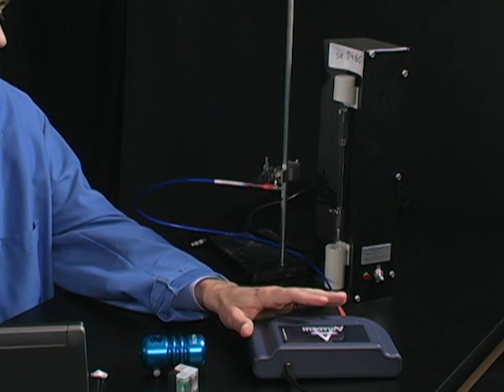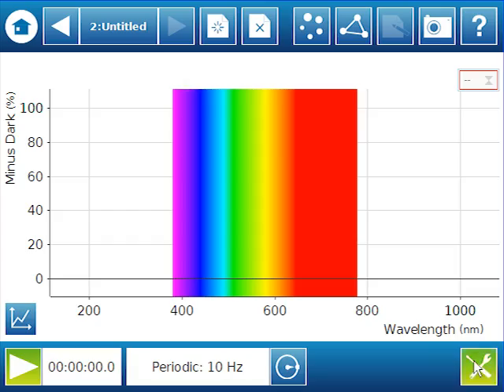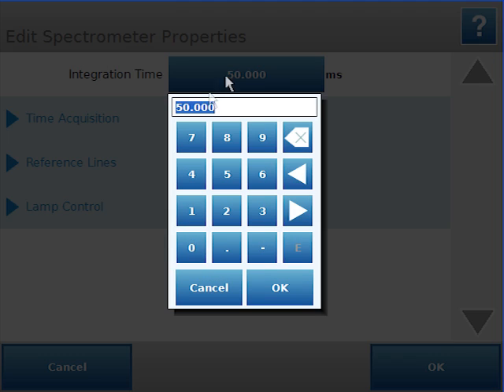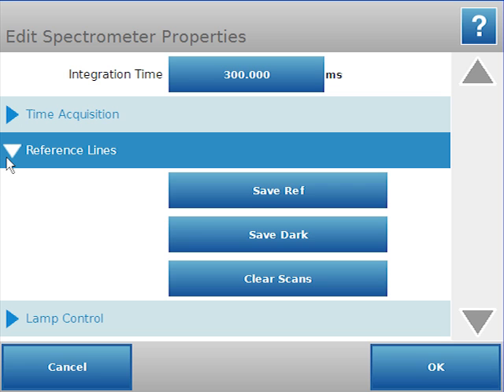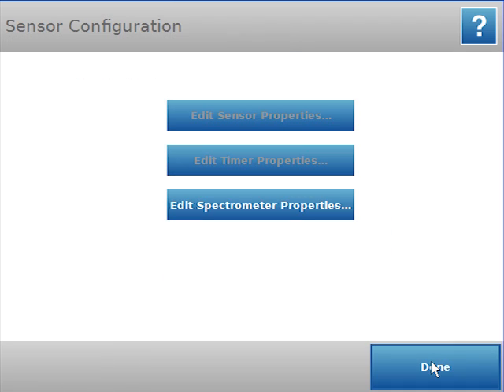So the way to do that is we need to tell the spectrometer—there's a fiber optic cable hooked up to this, so the light comes in here—we need to tell it that visible light is coming in, and we're subtracting for that. And we also need to tell it how long to look at the visible light. So it's almost like setting an aperture setting on a camera. So we're going to configure our sensor, edit the spectrometer properties. And for this particular portion of the experiment, I'm going to make the integration time 300 milliseconds. And I want to subtract the visible light. So I'm going to do a save dark.